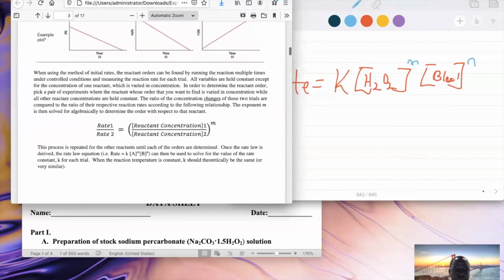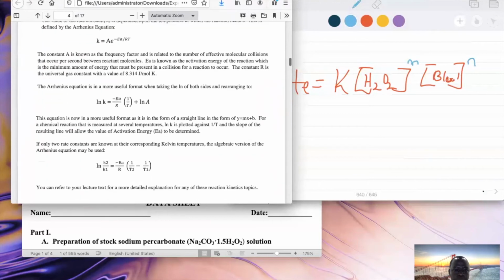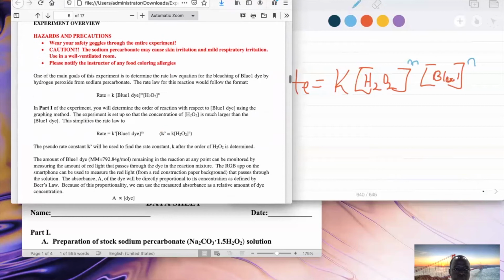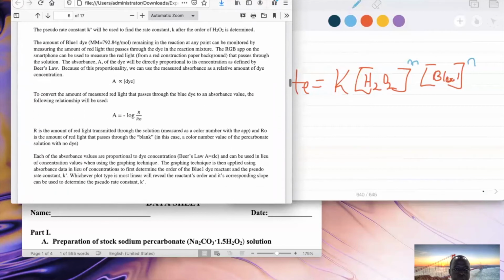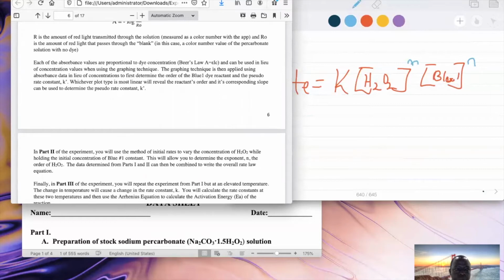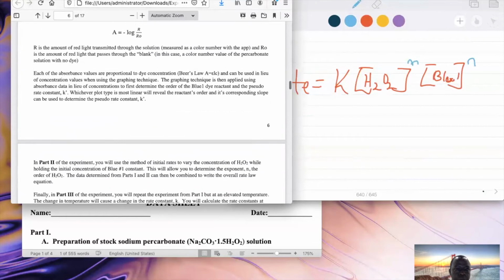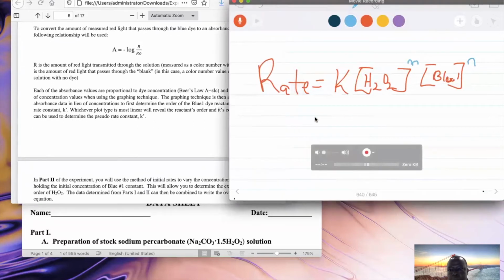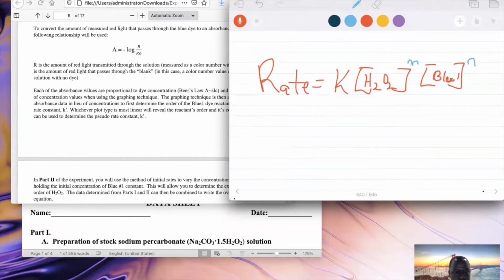collect the data based on the rate at which the bleaching kinetics of peroxide in OxiClean decolorize the colored food.